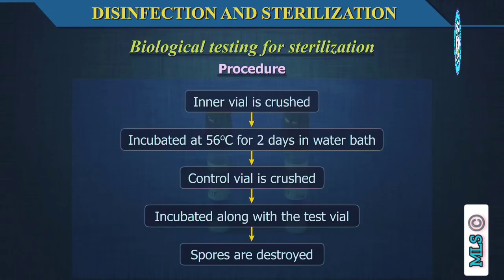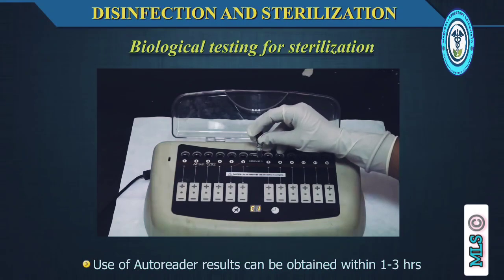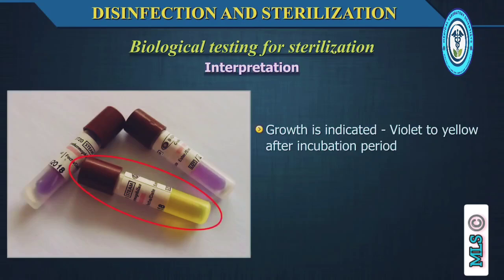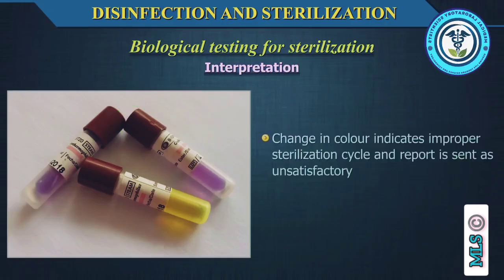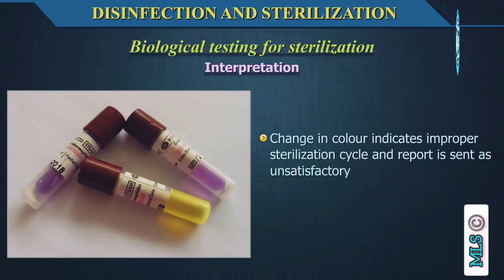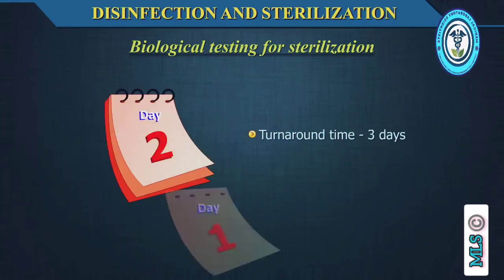Spores are destroyed if sterilizing conditions are met. The growth can be read manually or with the help of an autoreader. With the use of an autoreader, results can be obtained within 1 to 3 hours. Interpretation. Growth is indicated by change of color in the vial, for example, violet to yellow after the incubation period. No color change indicates the sterilization process by autoclave is complete and the report is sent as satisfactory, while change in color indicates improper sterilization cycle and the report is sent as unsatisfactory. The test is valid only when controls show color change. Turnaround time is 3 days.